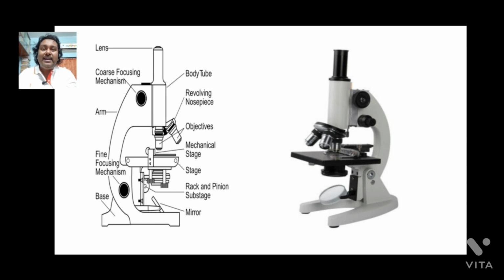The beam of light is formed, then it passes through the condenser, and condensation of the light rays occurs, and then it passes through the specimen and forms the image. After that it passes through the objective lens and does the magnification, and then also passes through the ocular lens and further magnifies the image. After that it enters into the human eye.